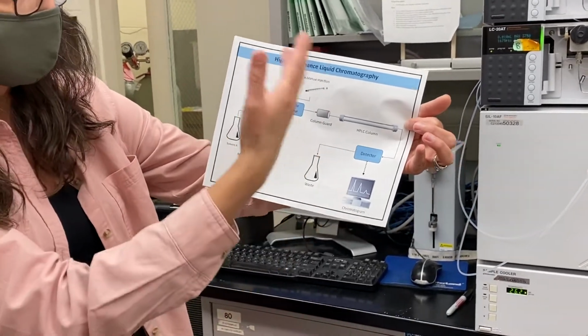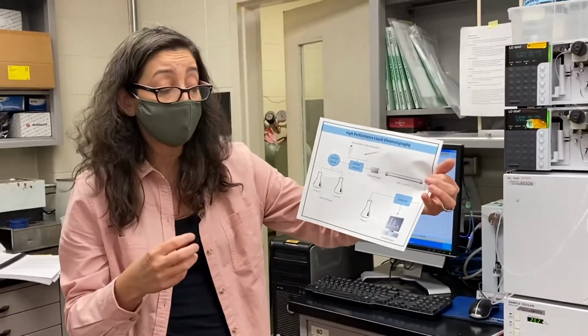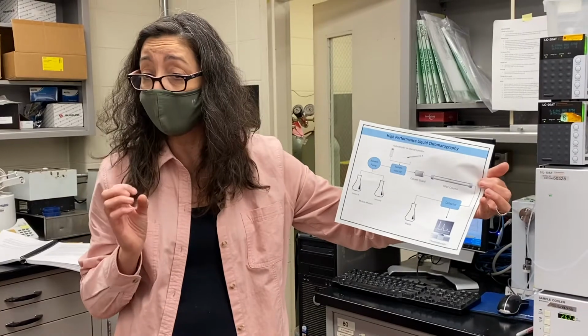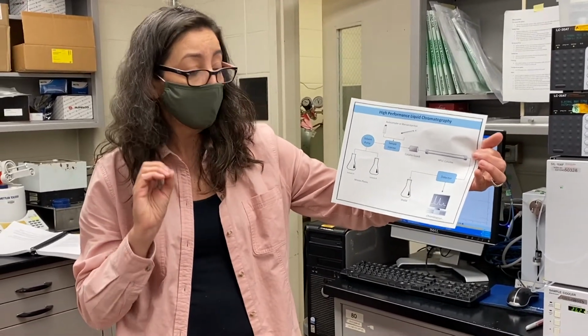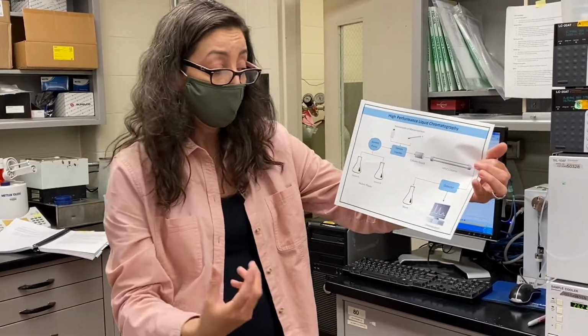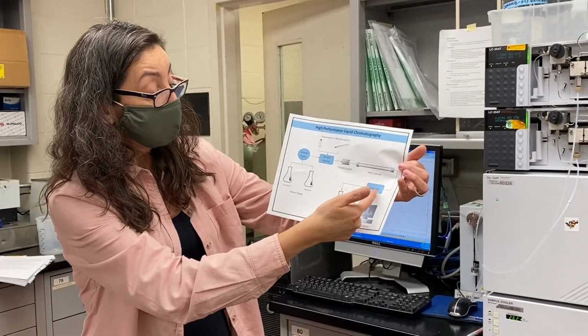The one detector that we will be working with is the UV detector, and particularly something called a photodiode array detector. The photodiode array detector is very unique, and it has a very specific ability that we will talk about today compared to a regular UV detector. And then from the detector, it will give you a signal.